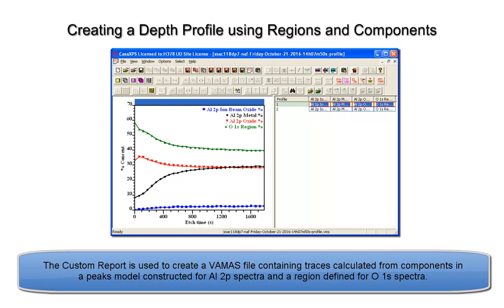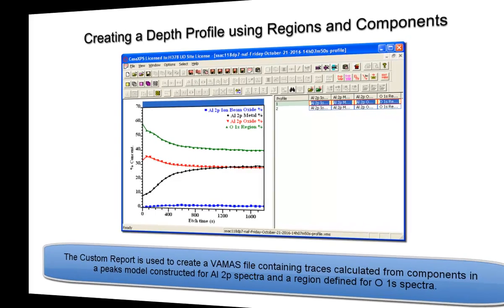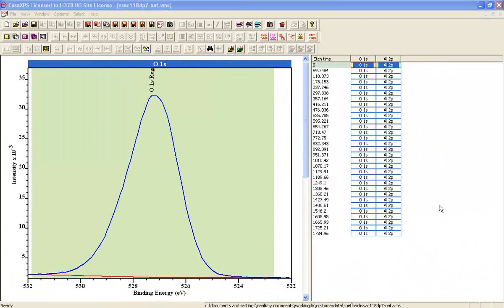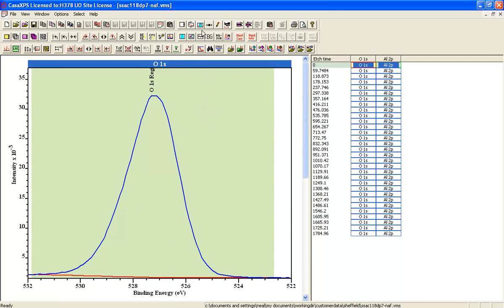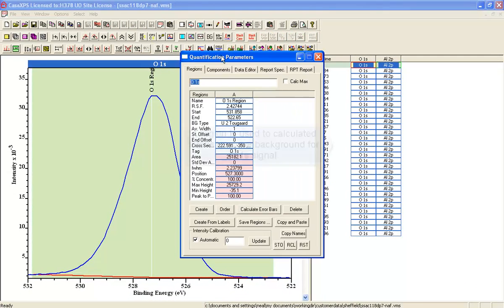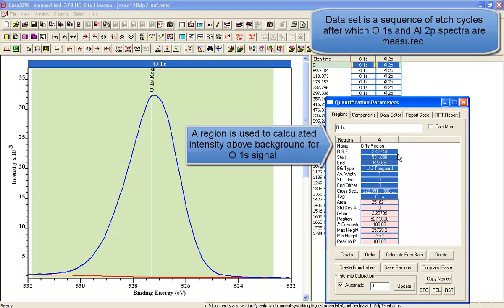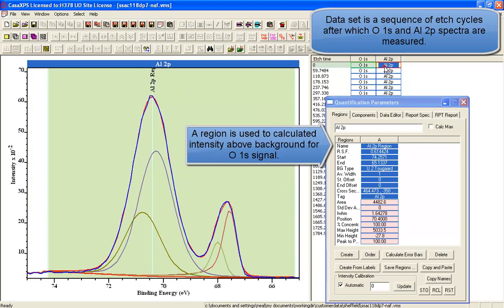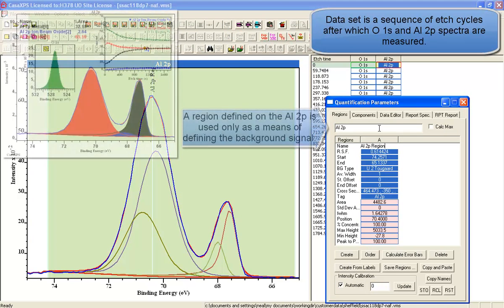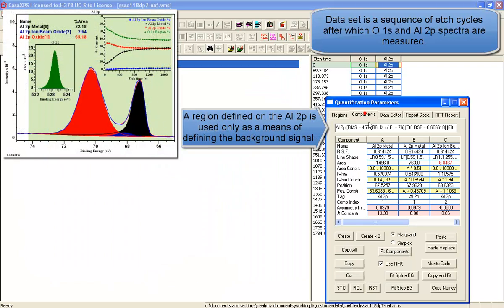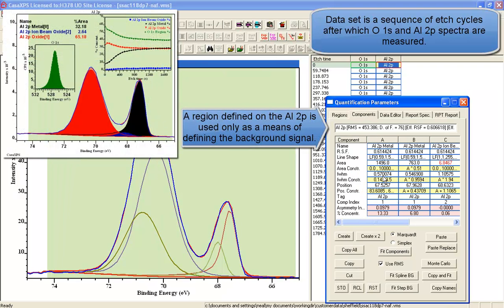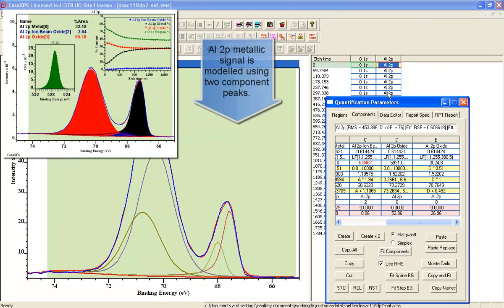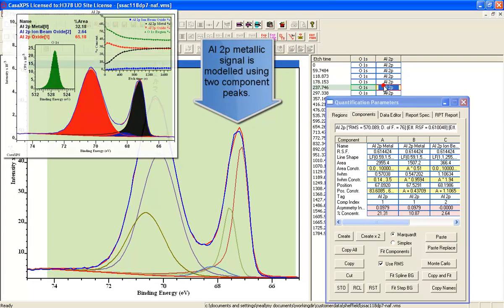An XPS depth profile consists of a sequence of measurements that are interspersed with etch cycles. In this example, we've got Oxygen 1S and Al 2P, and the idea is that we're going to create a profile from the region from the Oxygen 1S and the components from the Al 2P.